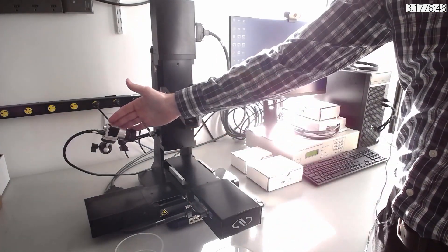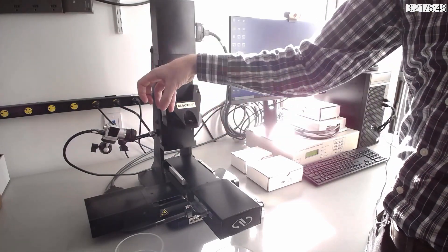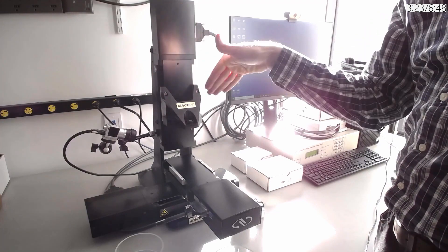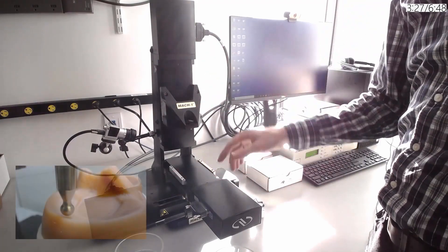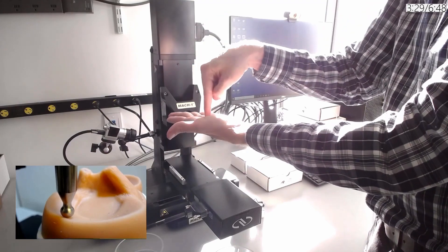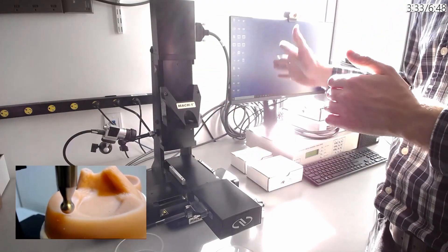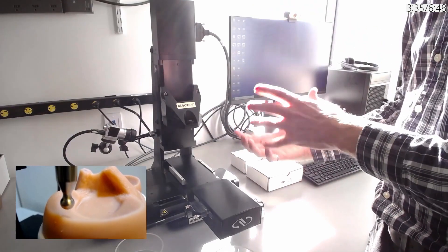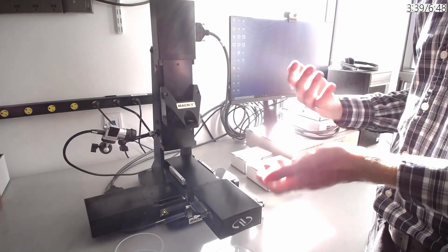The system can also have a camera added to it, which serves two purposes. First, you can point it at your sample and then using our software set a grid of points on the sample. For the three-axis system, you can automatically indent at every point in that grid by pressing the execute button once, then use that same template for other samples to easily compare and perform statistical analysis.